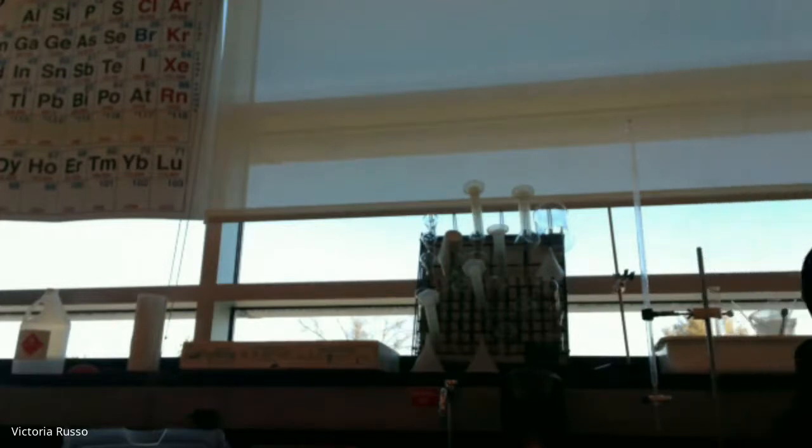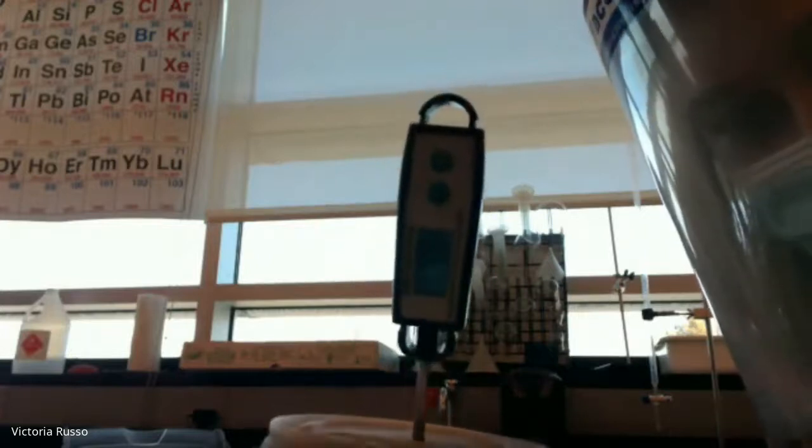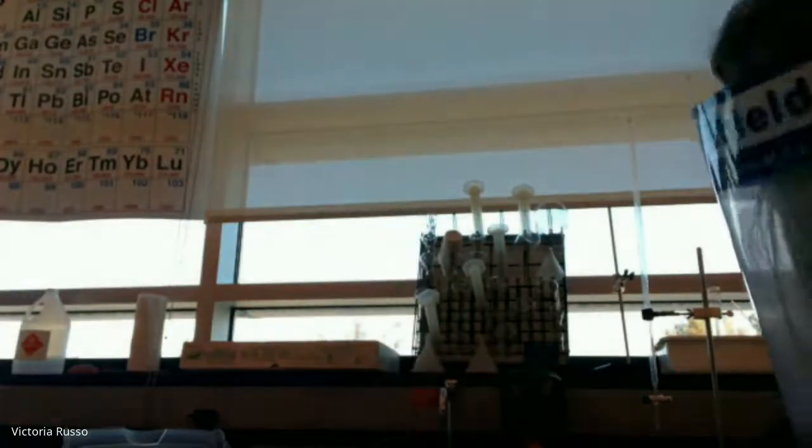Okay, so if we go to the next part of the lab, it says place the lid on top of the coffee cup and place the thermometer in the hole. So there's a hole in this cup. And I'm going to place the thermometer in the hole. And it is going to measure the temperature of the water. I don't know if you can see the numbers. Hopefully you can. But again, this is just measuring the temperature of the acid that's in here. I'm going to wait till it comes to an equilibrium temperature. So that means the numbers stop moving.